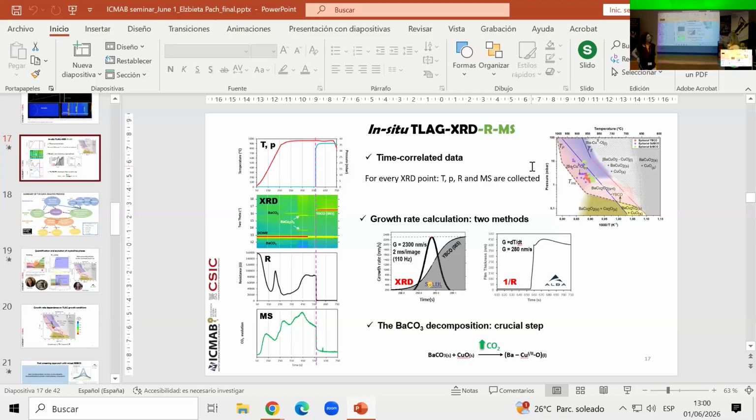But also the difference, you mean here? This is because of the phase transformations that happen. So this peak in resistance is because of a transformation? Well, this particular one, I don't know, ONA is still analyzing to be able to say with confidence. This one is the one troubling us, yes.